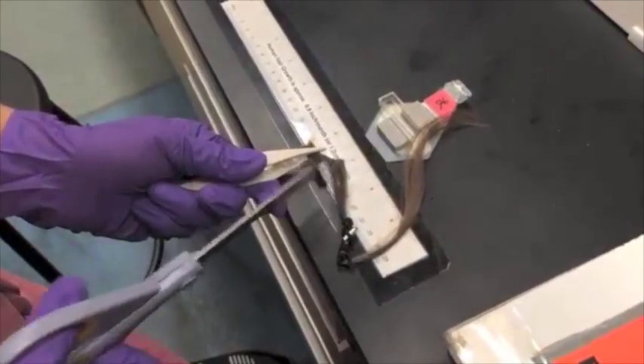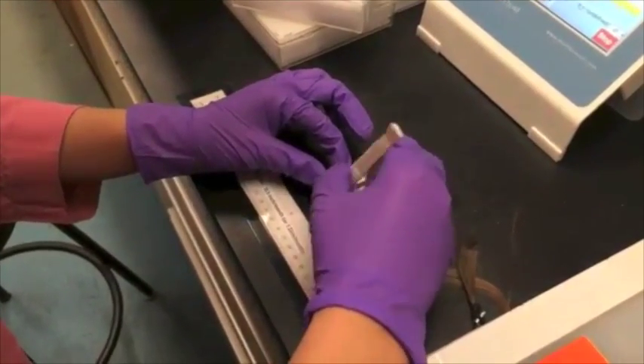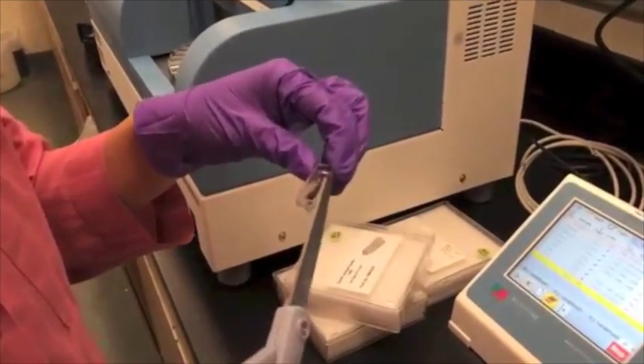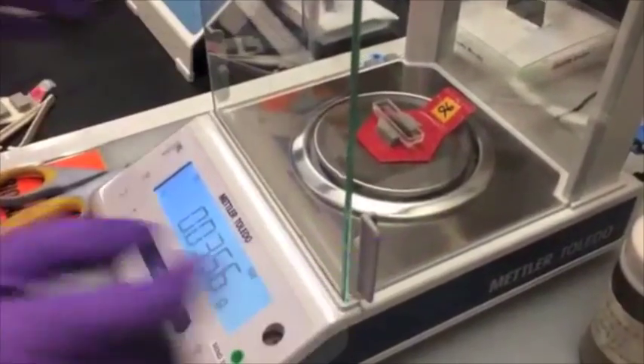We then weigh each sample the same way as we measure the fish tissue. Here I carefully put them in a sampling boat, and trim the few straight hairs that might be sticking out. We place the samples on the tray just as we did for the fish tissues, and the machine will analyze them for us.